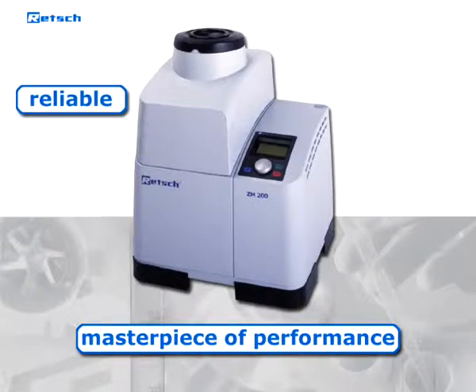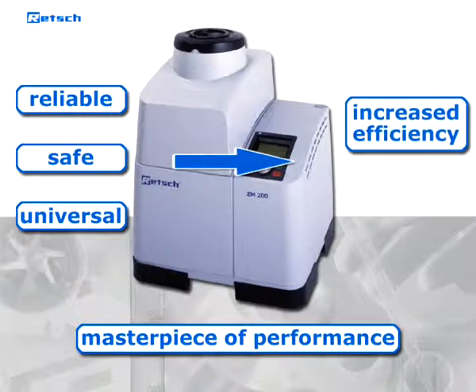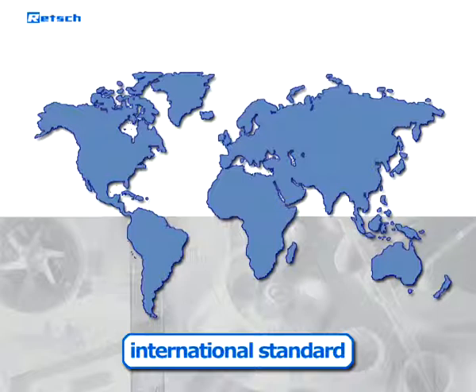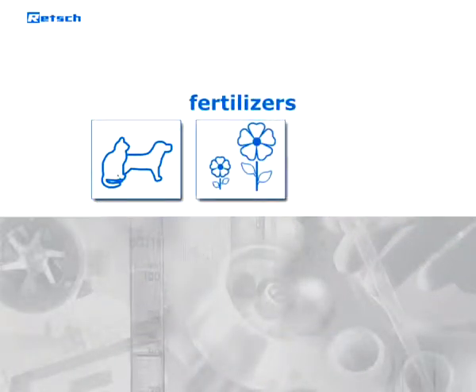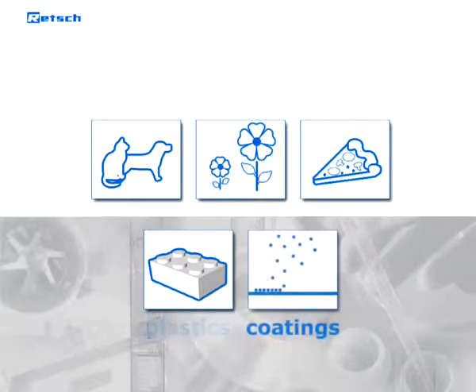It is a reliable, safe and universal device which increases the efficiency of sample preparation in terms of process time and optimizes the grinding result. The ZM200 has become an international standard in a variety of industries like animal feeds, fertilizers, food and food additives, and plastics and powder coatings.